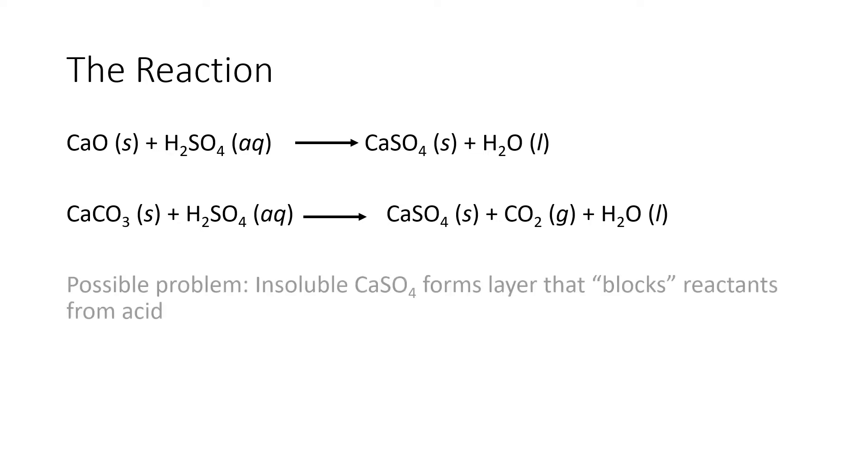There are problems you can encounter. For example, as the calcium sulfate begins to form, it is insoluble, and what could happen is it might form a layer that blocks the reactants from reacting with the acid. How do we solve this? One thing we're going to do is use concentrated sulfuric acid. That means we're going to hit this mixture with a lot of sulfuric acid to overcome any blockage from the calcium sulfate product.